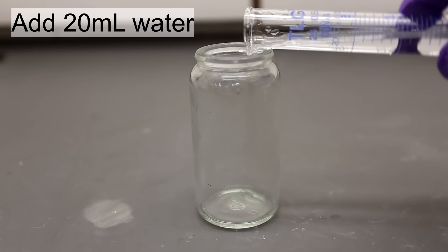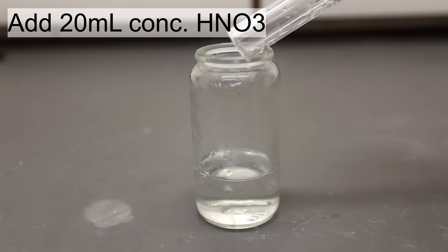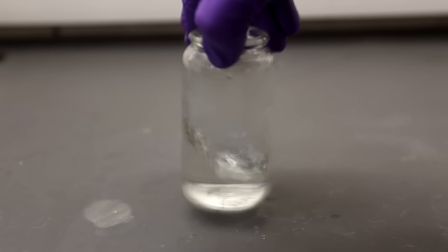First I added about 20 milliliters of water, followed by about 20 milliliters of concentrated nitric acid. I then swirled the solution around a little to mix it.